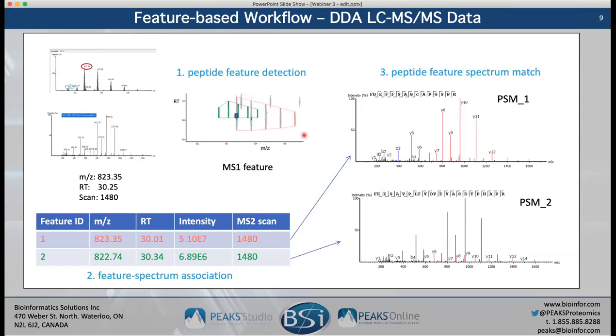Matt, question: PEAKS works with MSE data. Does it work with Waters SONAR data? I don't think we've ever tested it, Matt, because we don't have any of that data, but certainly if you have some and can provide it to us, we can try it or work on it, add it in as a feature.